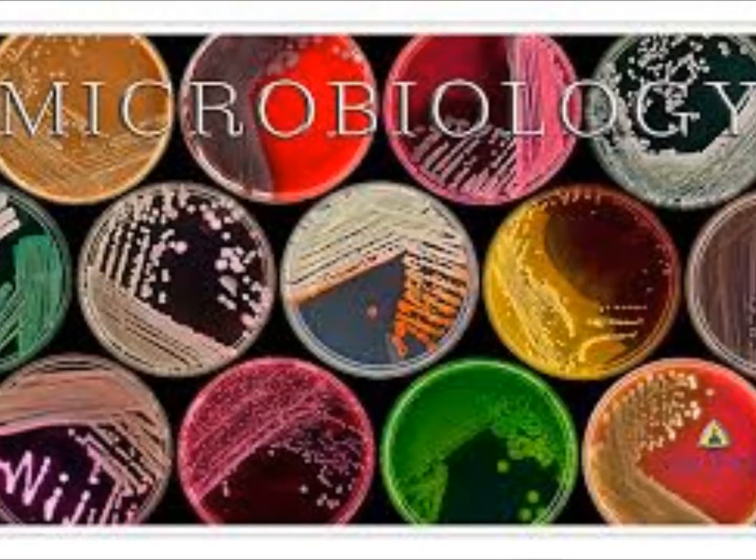You're gonna have minimal written on the MAC and the CNA. Your morphology descriptors are on the blood plate always. It's smooth, it's the right one.